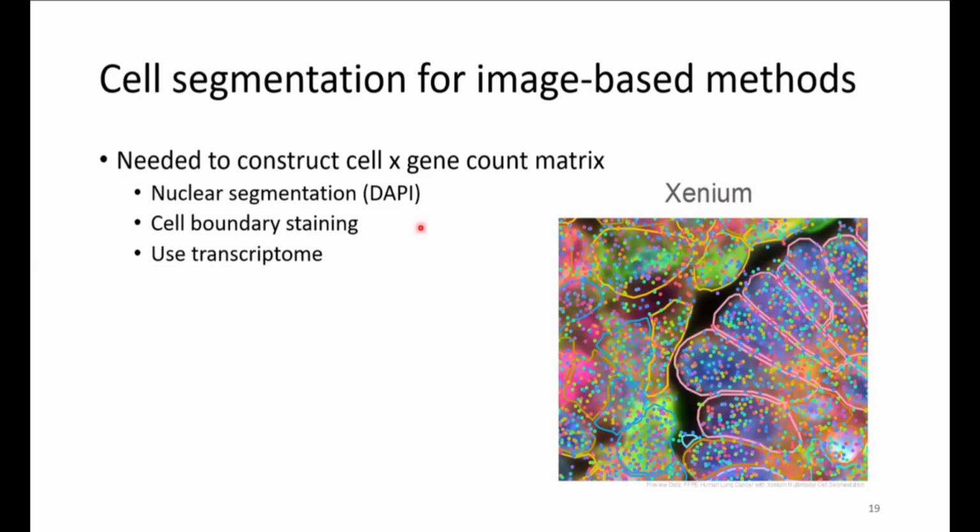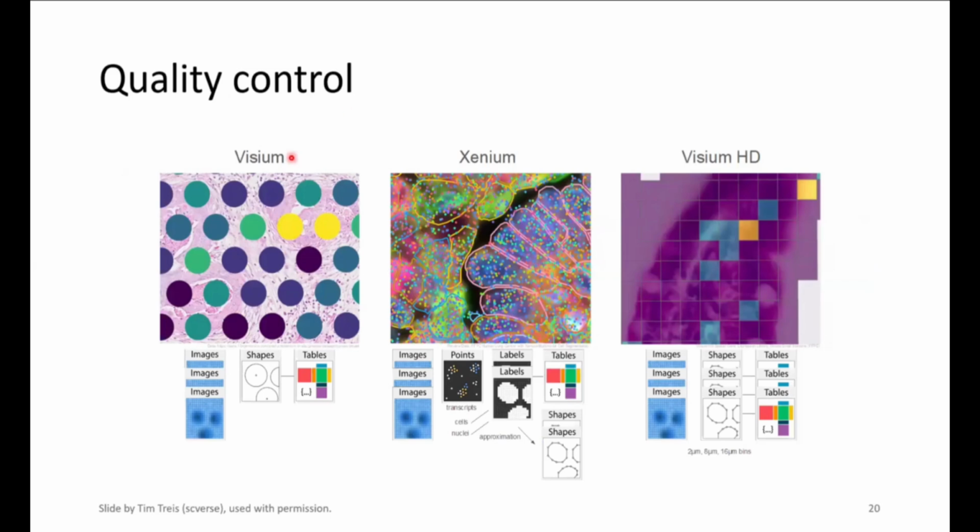And I'll touch that later if time permits. But that would be the first step. And once you have that, I'm just showing this slide here with the Visium and Xenium and Visium HD, different technologies. One thing that all these have in common now is that you have these tables.